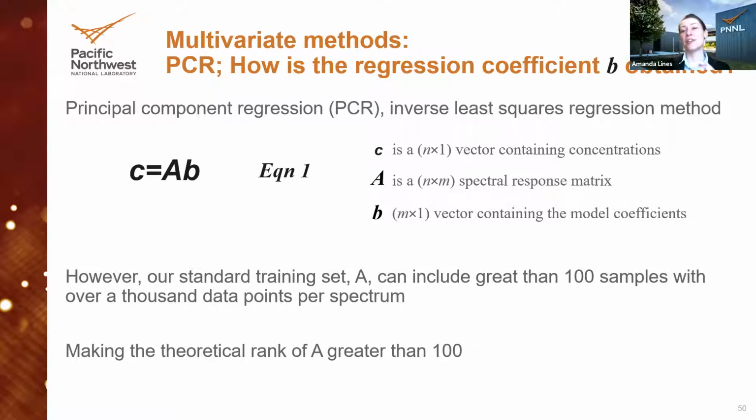Ultimately, I used chemometric modeling as a very general term in this talk, just to back up and make sure we're setting the stage to answer this question accurately here. Chemometric modeling includes a whole bunch of different mathematical approaches you can take. There's things like classical least squares, partial least squares, principal component regression like we've listed here, all the way out to things like artificial neural networks and so on. So there's a lot of different mathematical approaches, and basically all of those are geared towards digging into those details from your data that you're most interested in.